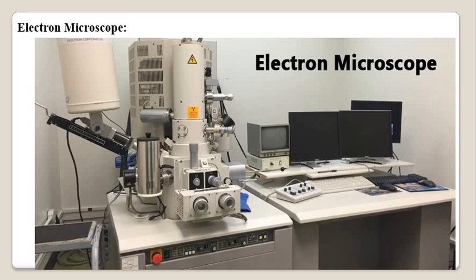The electron dispersion is due to the atomic nuclei, which consist of protons and neutrons, and the higher the atomic number, the greater is the dispersion. Biological materials generally have a low atomic number, so dispersion of the electrons is poor, and thus it results in poor contrast in the image formation. So on the whole, it works on the principle of electron scattering.